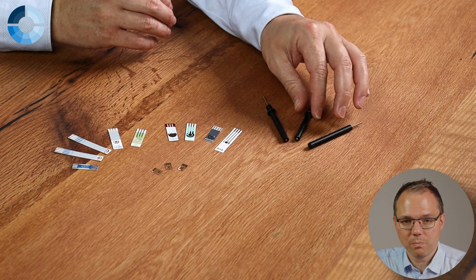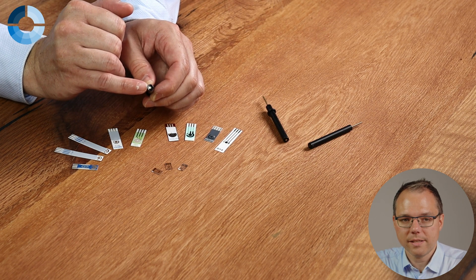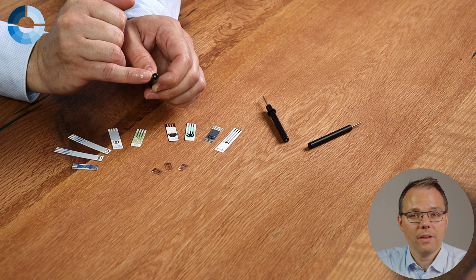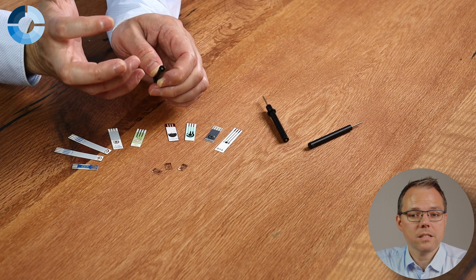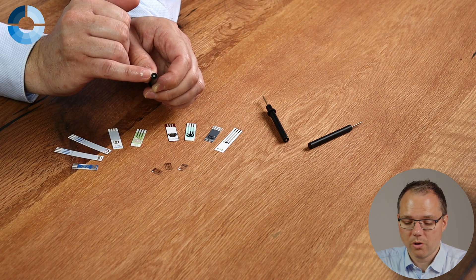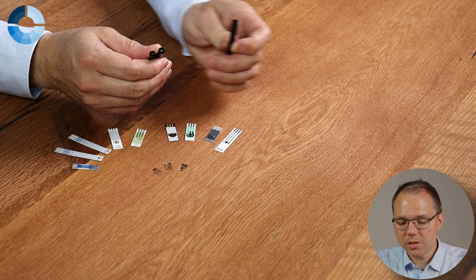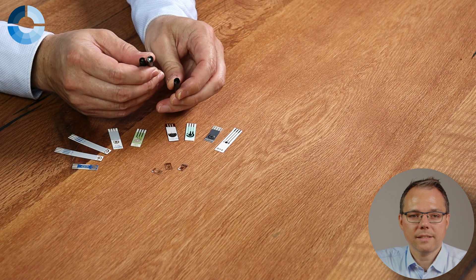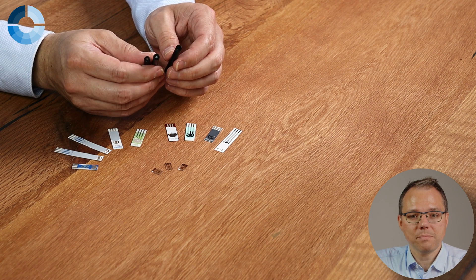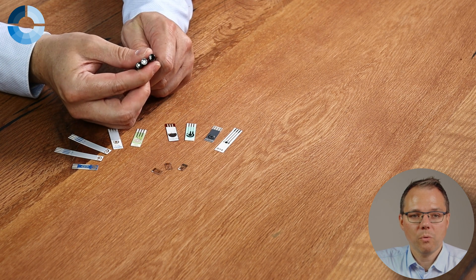These are the very common electrodes that most people know — metal discs surrounded by some kind of polymer, usually an inert, chemically resistant polymer so it doesn't interfere with your measurement. You have an exposed metal disc polished to mirror shine; common materials are gold and platinum. Another typical material is glassy carbon, which is glass-like carbon — a carbon species that you can polish and use like a metal. So these are three very popular types of working electrodes.